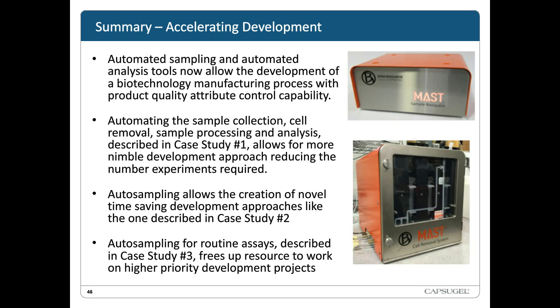The second case study shows a completely new way here in our labs how we designed and operated an experiment using the perfusion system as a reaction cell, where you can make step-based changes, not just on galactose, but say you could do different pHs or different other medias or other changes and watch the cell response. And you could set up an automated series of experiments that each take 2 or 3 days to run in a perfusion system.